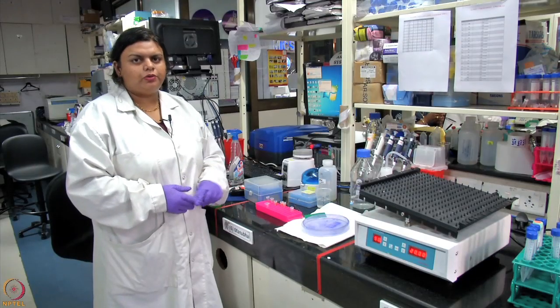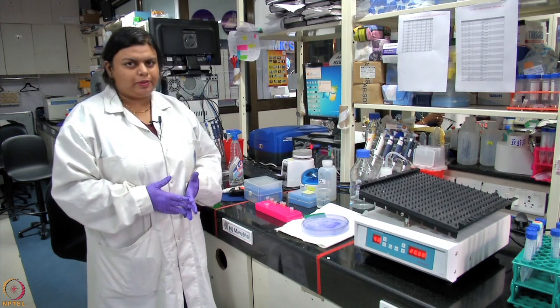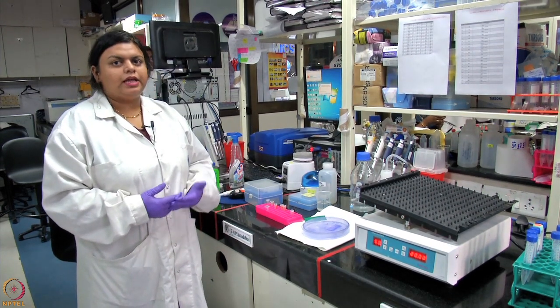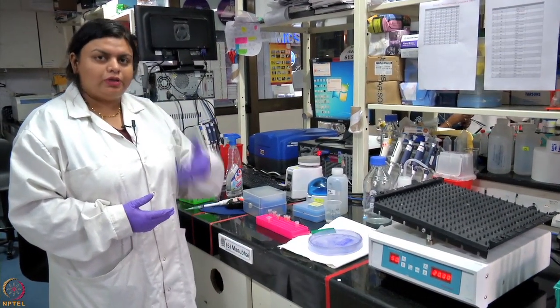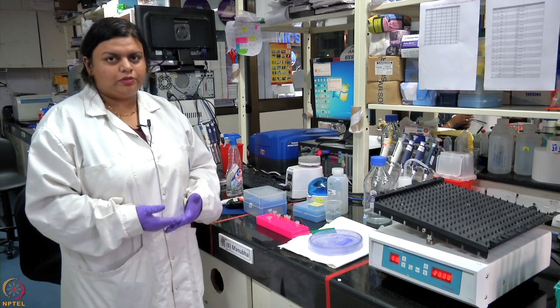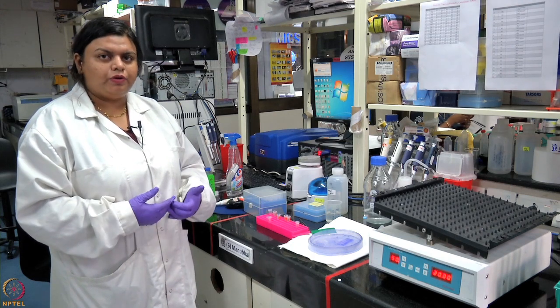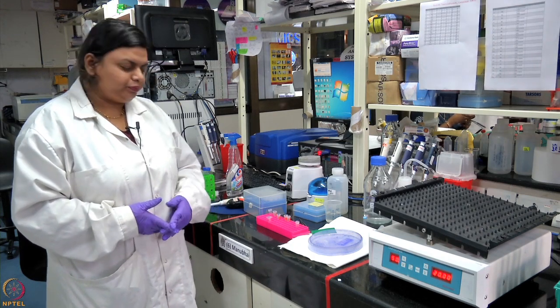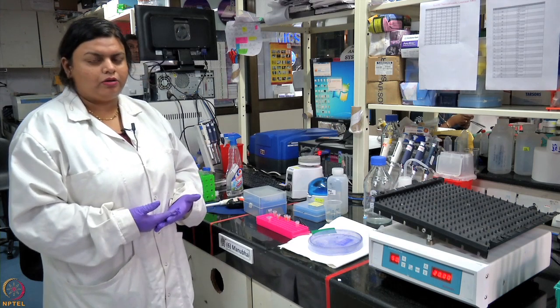Hello students, so in continuation with the lecture where we learned the theoretical aspects of IPMS, that is immunoaffinity and immunoprecipitation based pull down followed by mass spectrometry, today we will see what are the steps in which we can perform this experiment and how to do that for your biological problem. So first of all, just to brief you a little bit about the steps.